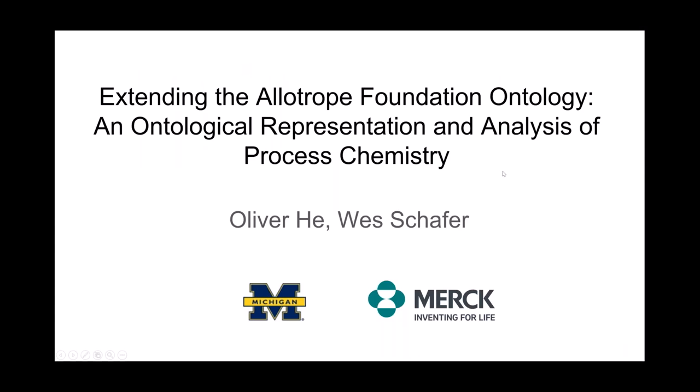Okay, great. Thank you. So here we would like to talk about an extension of Allotrope Foundation Ontology. This talk will be given by, the first part will be mainly me, and the second part will be mainly Wes from Merck. So this research has been funded by Merck for a one year pilot study to our Michigan, and I'm basically implementing the work. This work is on how we can possibly use ontologies to present and analyze process chemistry.